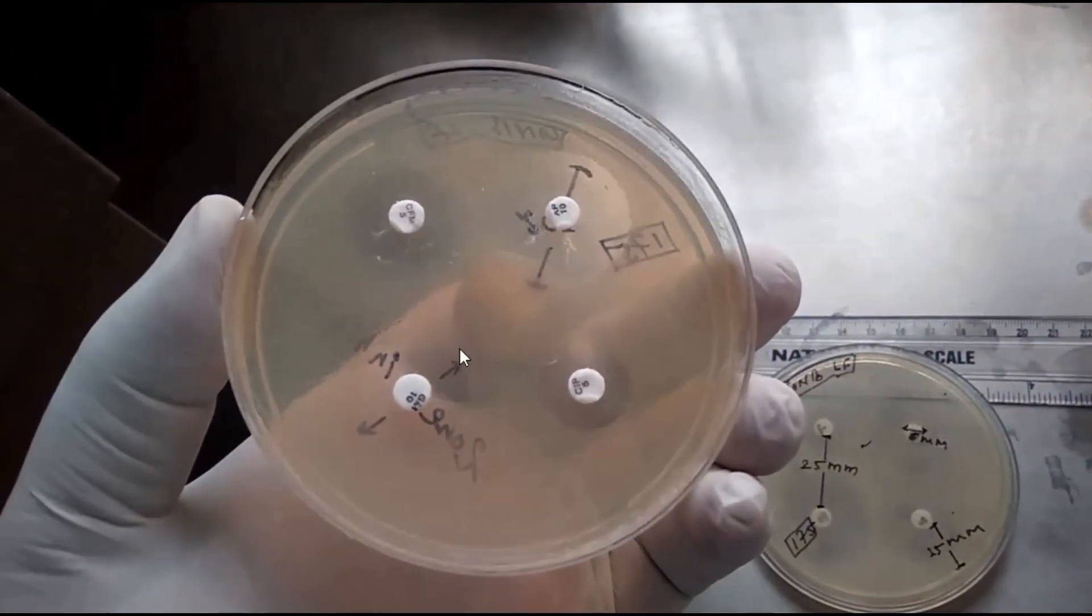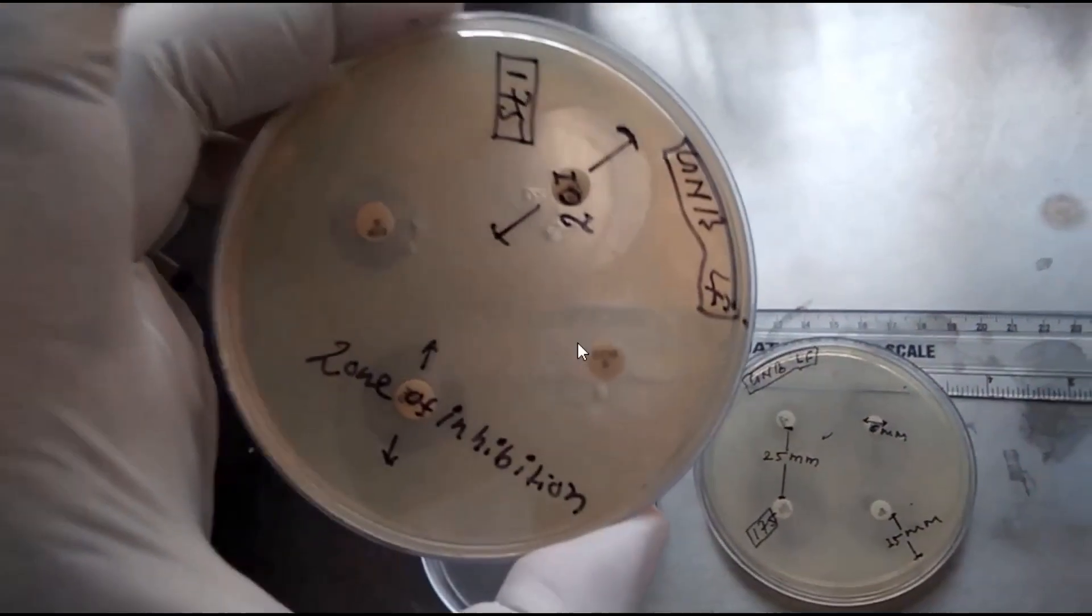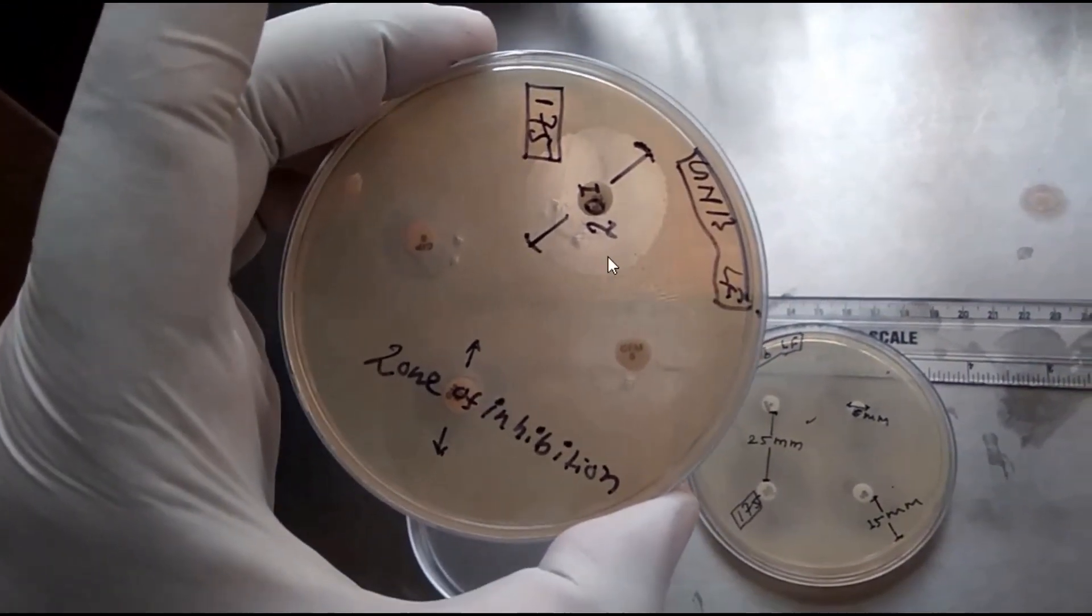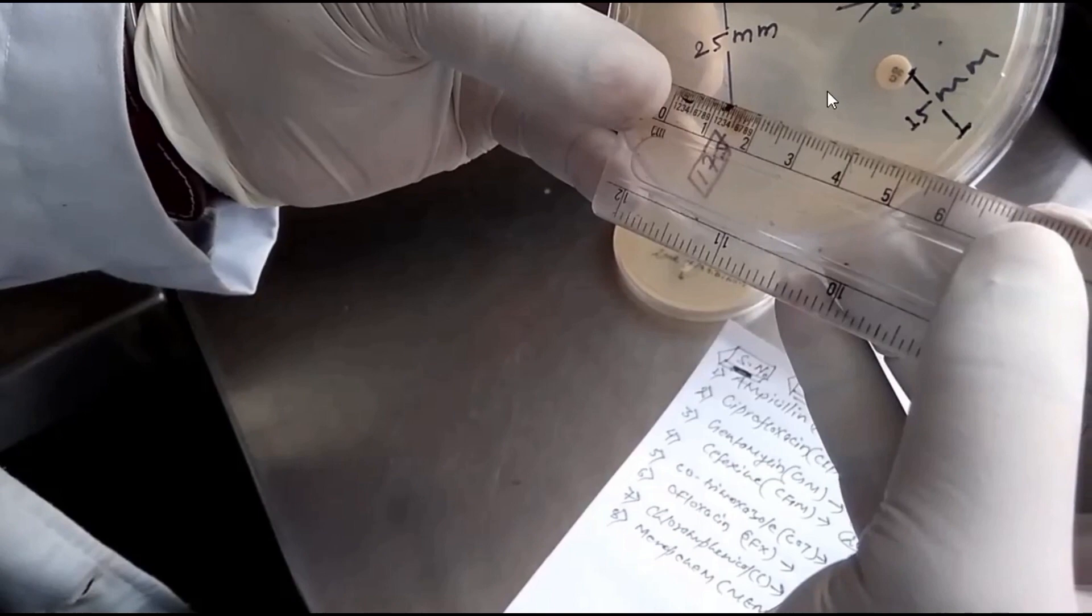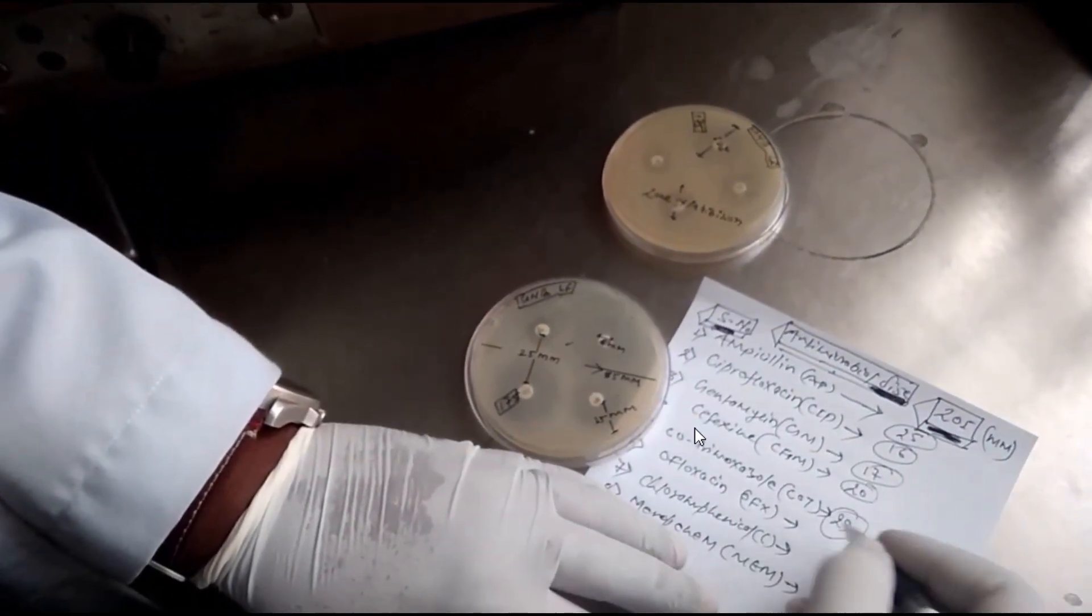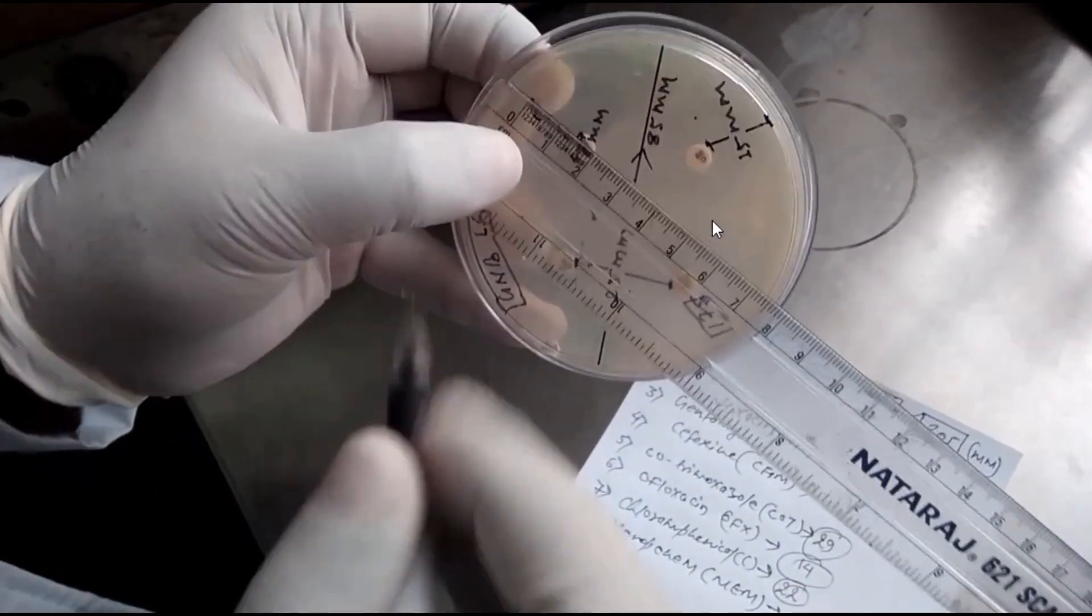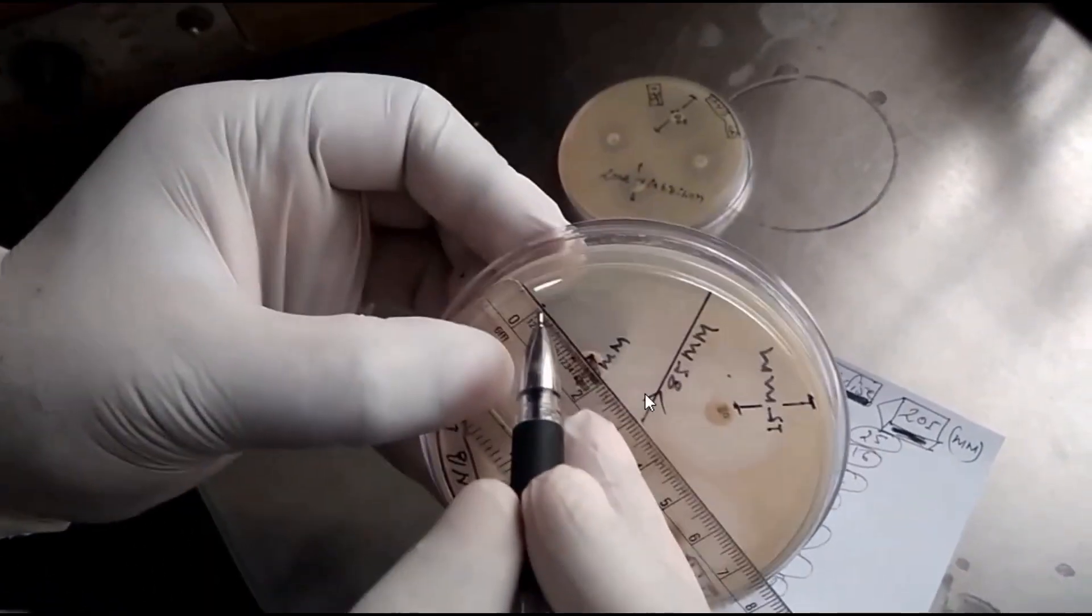After overnight incubation, here you can see this type of zone of inhibition we got. So now measure the zone of inhibition for all of the drugs in this way.